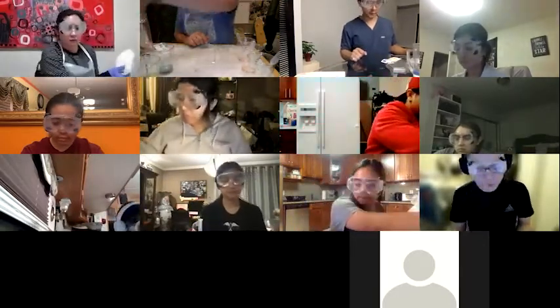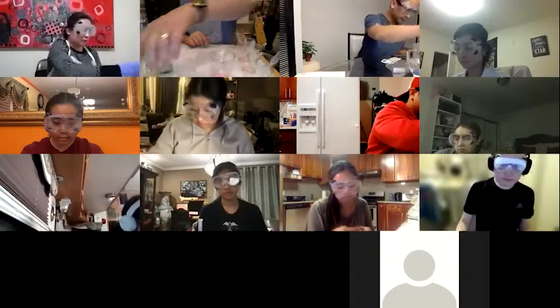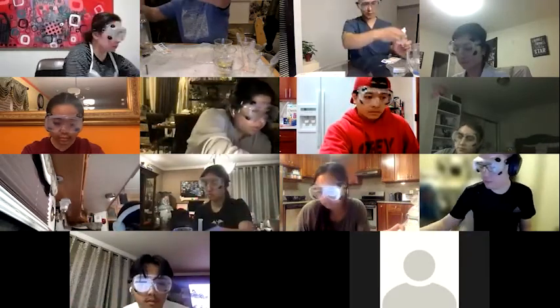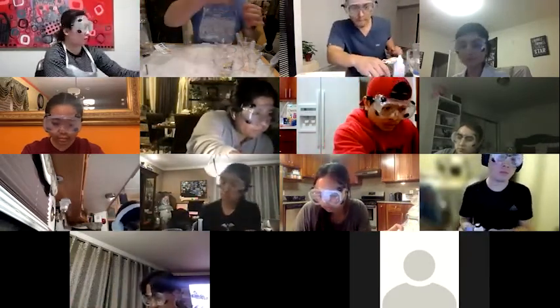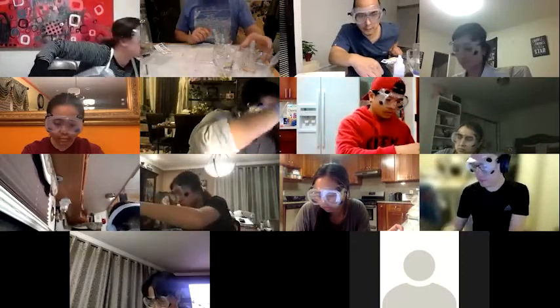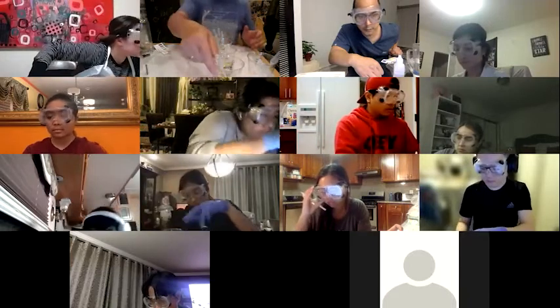So acetic acid in the first. Arrange these. So acetic acid in the first, water in the second, acetate in the third, one, two, three, and then 3.7, 4.7, 5.7. Okay.